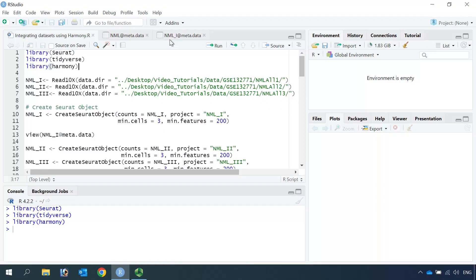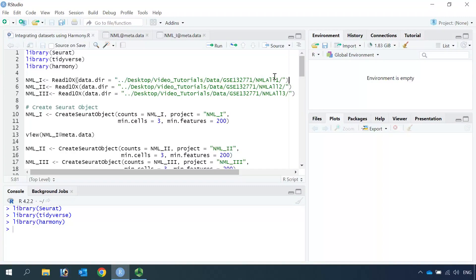For today's demonstration, I'm going to use the GSE132771 dataset again. In my first Seurat video, I showed you how to download the dataset and read it into R. Today we are going to use the data from three healthy donors, and the dataset contains all the cell types found in healthy lungs. You can find the datasets as NML01, NML02, and NML03.